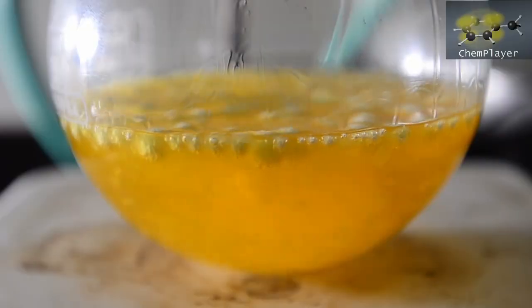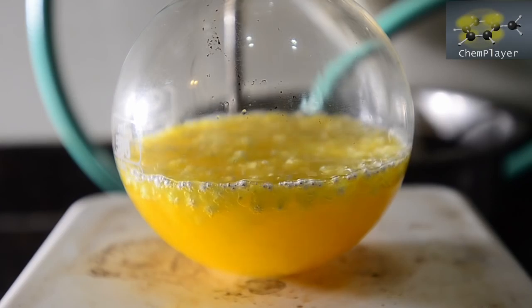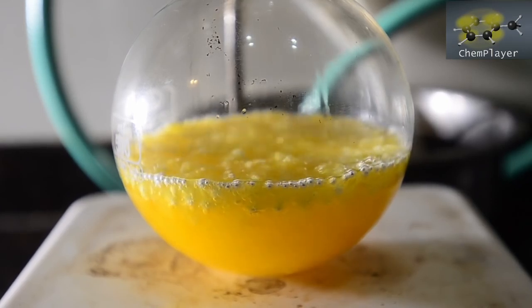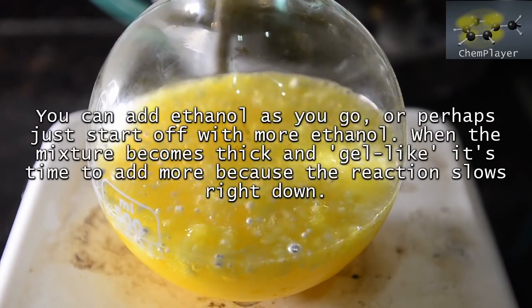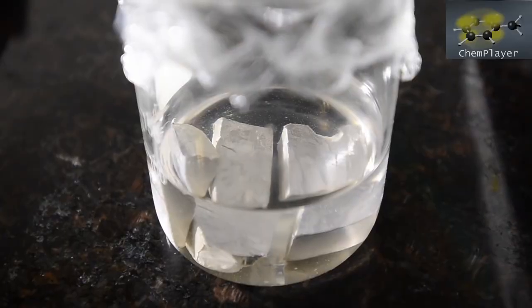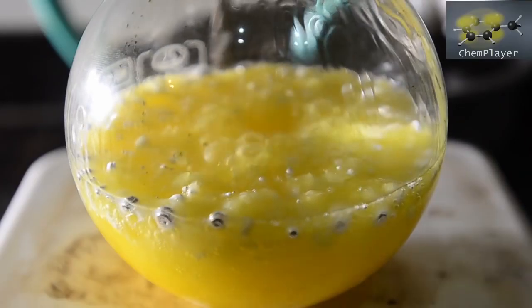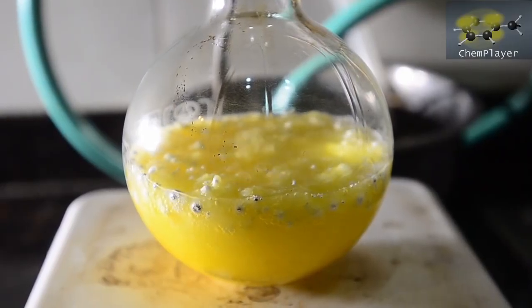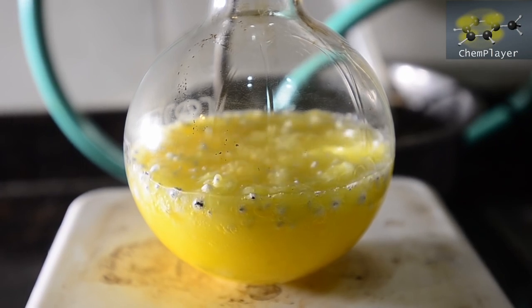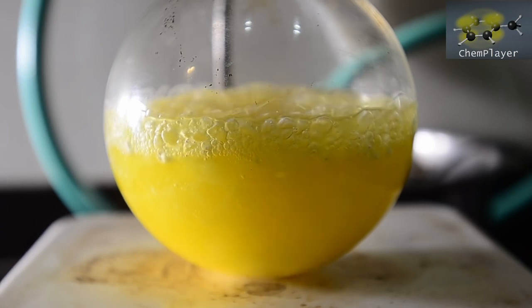At this point the reaction slowed right down, and we could see the sodium ethoxide starting to crystallize out in the mixture, forming a gel. We kept going and added a little more ethanol bit by bit to the flask to keep the mixture liquid and stirrable. The last part of the sodium to go now. So let's throw caution to the wind and get it all in there. The reaction is now quite slow, and we needed to add a lot of ethanol and wait quite some time for the reaction to complete. We'll let you watch the end of the reaction and we'll be back in a moment.